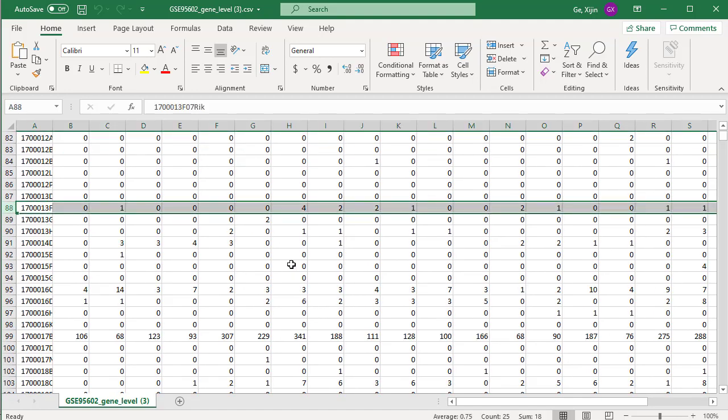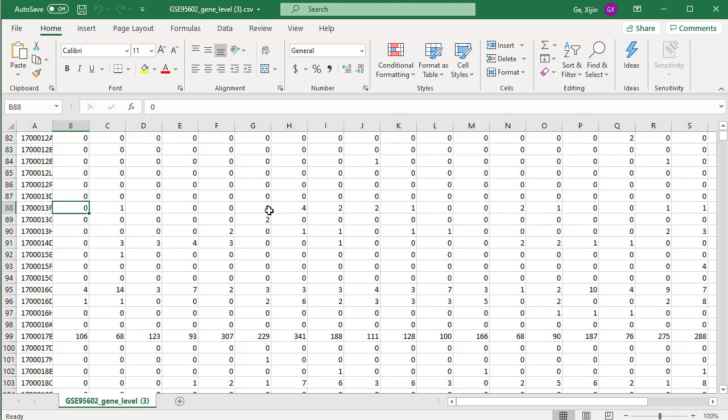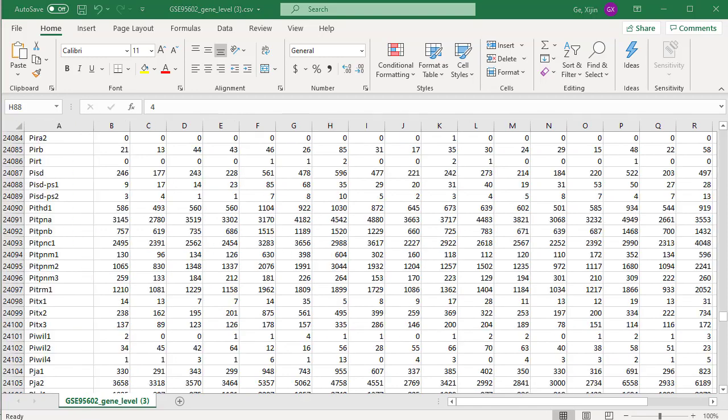So what we decided to do in the end is keep genes where at least one of the samples has decent measurable expression, at least a few counts, a few reads. For example, this will be borderline. I think we need, yeah.